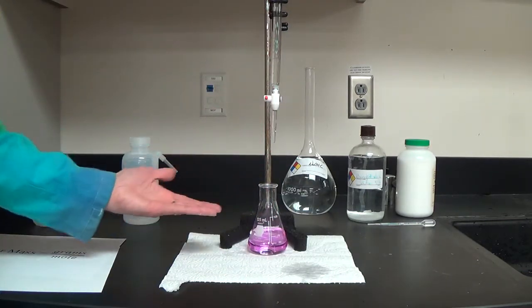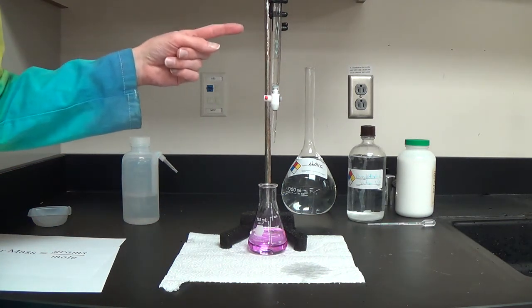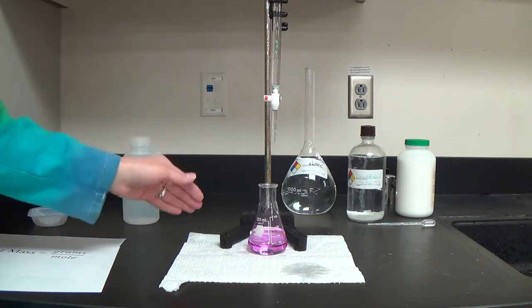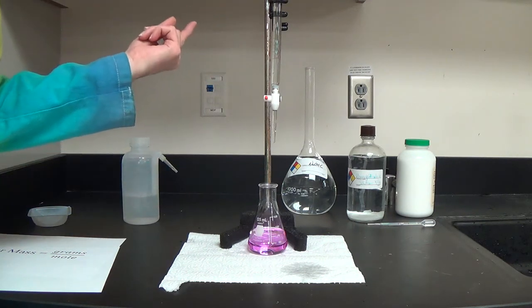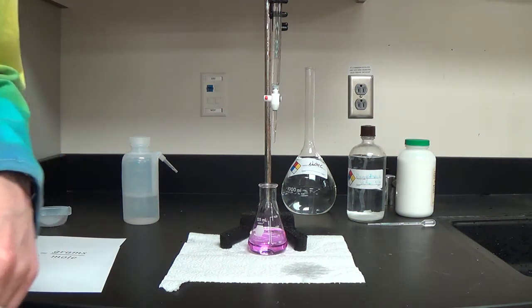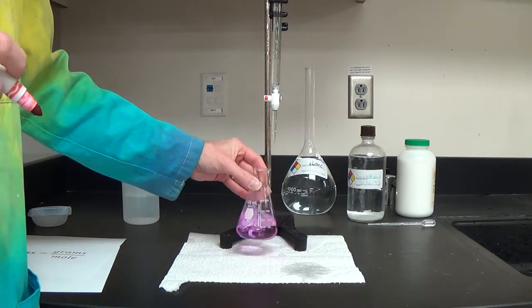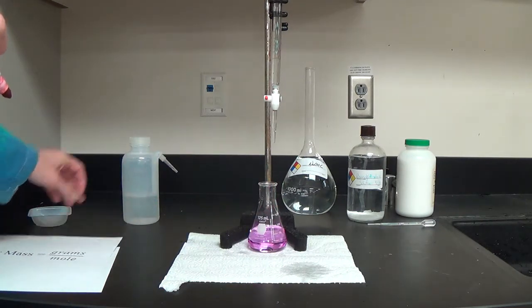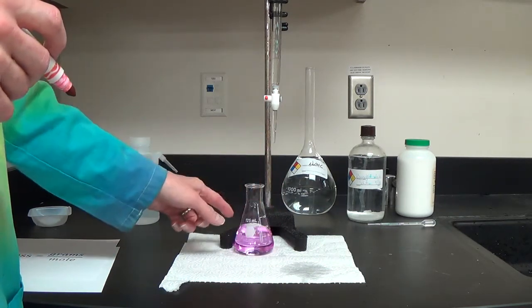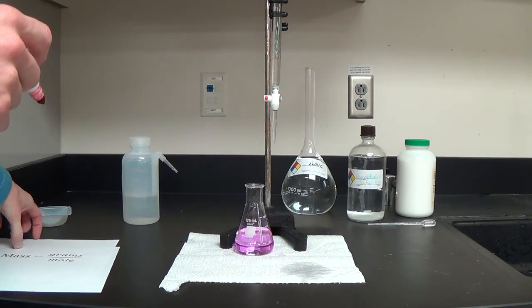That would have done me no good if I hadn't already marked my beginning point — my beginning milliliters — and my ending point, my ending milliliters. So before you start, be sure that you mark the initial volume in your burette and the final volume when you're done. Now that it is pink and I know it's been neutralized, I'm going to use the information from my titrant to find what that acid was. I'm looking for moles of acid. I have grams of acid — I measured that.